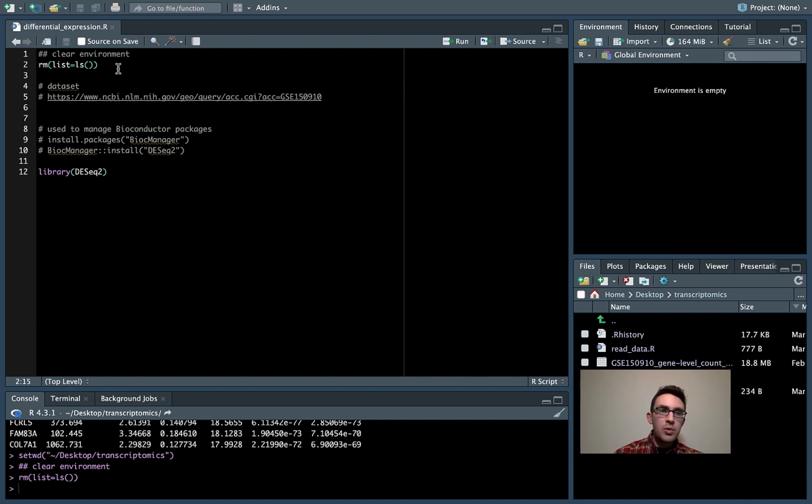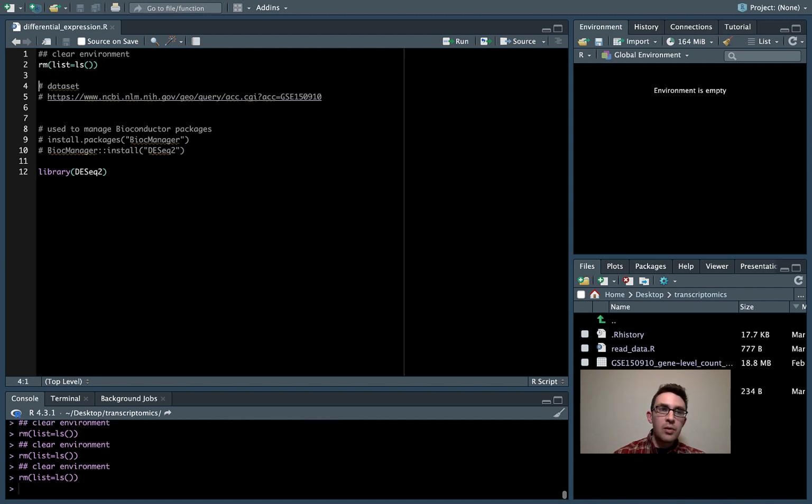So like usual, I always have this line at the top to just clear the environment if I need to. And then, like I showed you guys in the last video too, whenever I'm dealing with real data, I like to put as a comment the link to where I got the data. So if you guys haven't downloaded already, you can download the data set at this link here. Remember, this is the GEO website where you can find all these publicly available data sets.